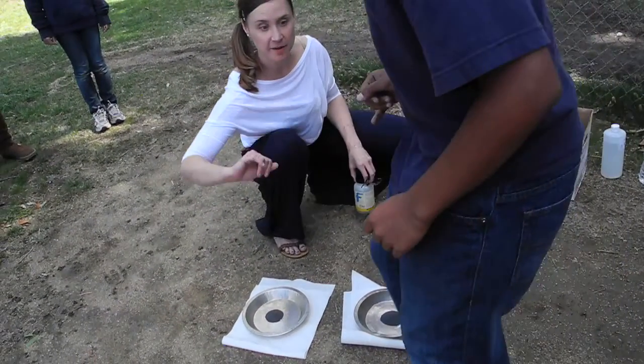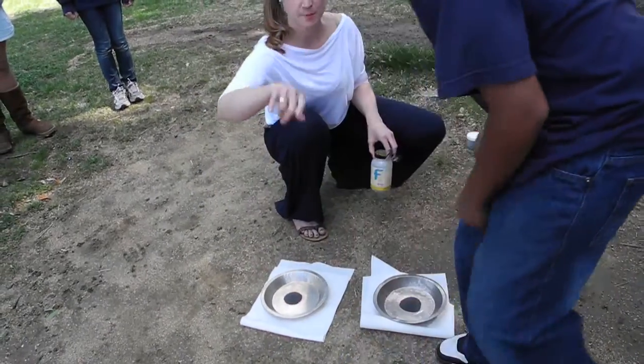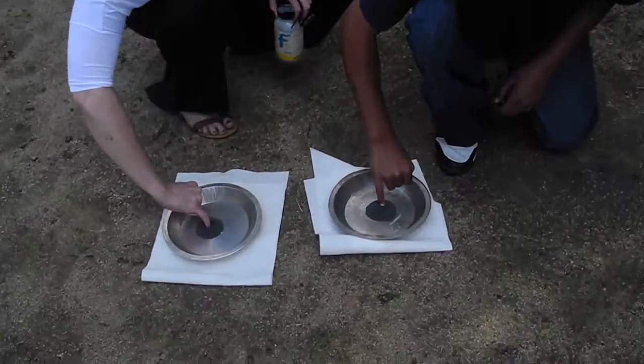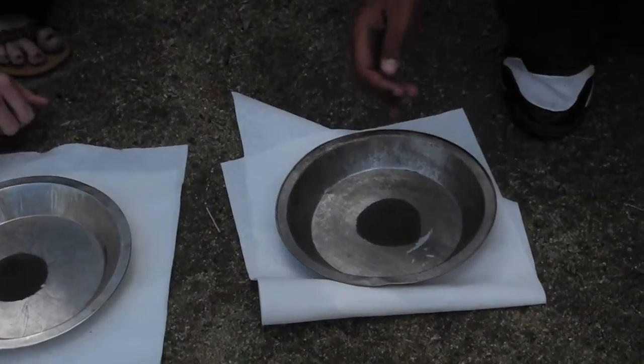Probably your smallest finger possible, and try to remember that the camera's behind you, so you want to, yeah, there you go. Go ahead and make a divot if you can. Okay, maybe a tiny bit more.